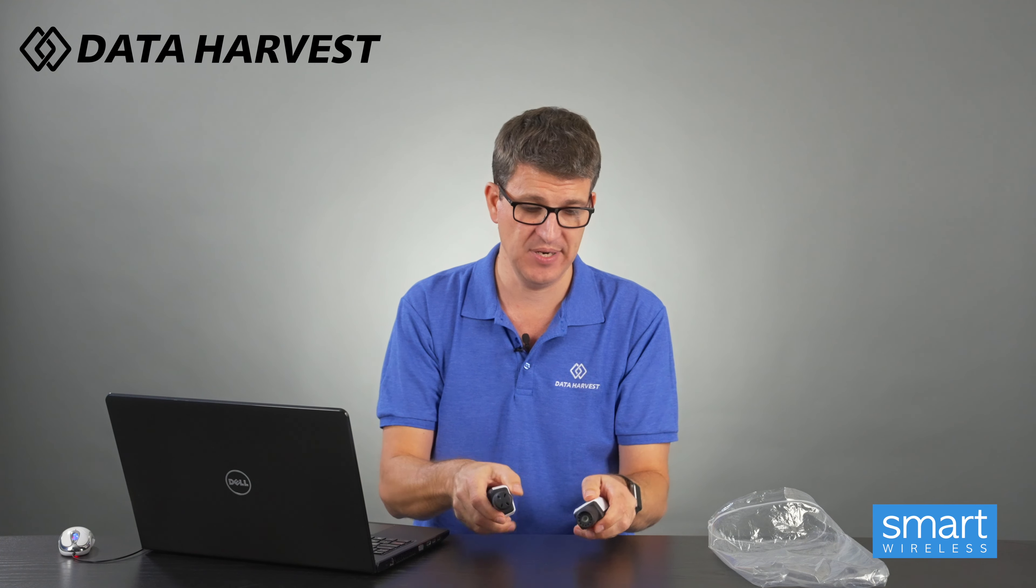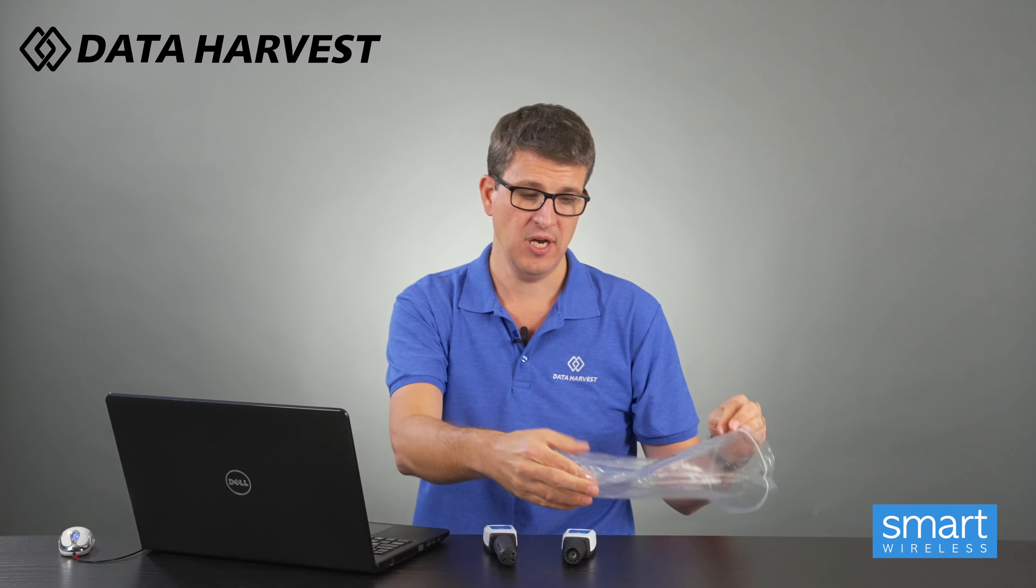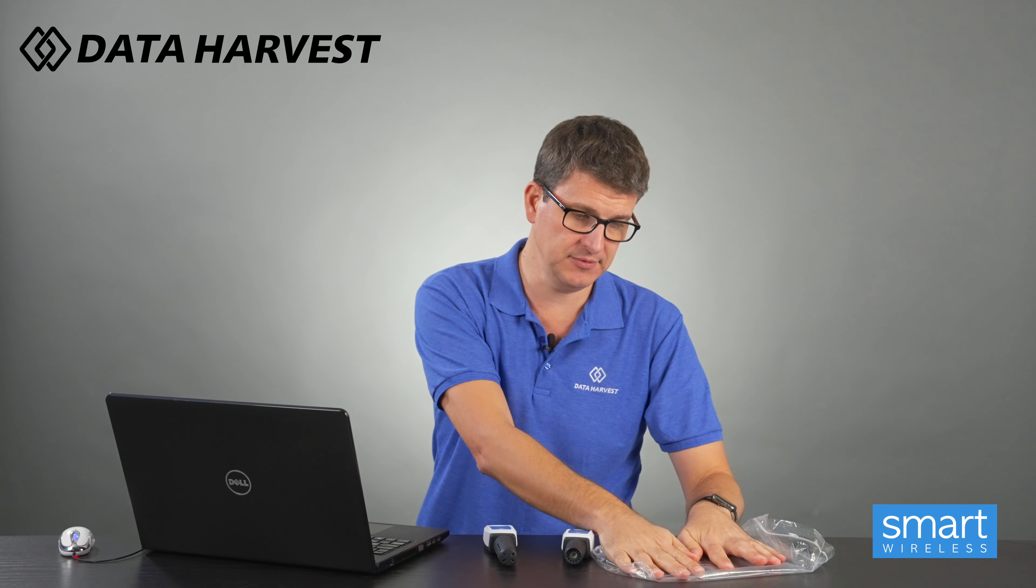Today's experiment is going to be using them with a bag, try and put as much air out of the bag as possible, one breath into it, seal the bag and then we're going to watch it attach to the EasySense 2 software and watch and see what happens to all four of the sensors.